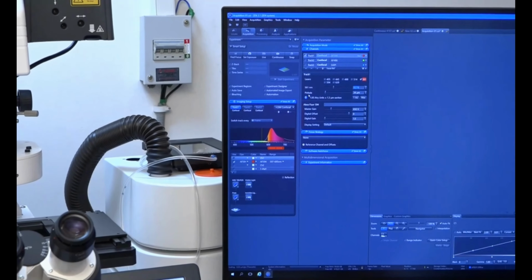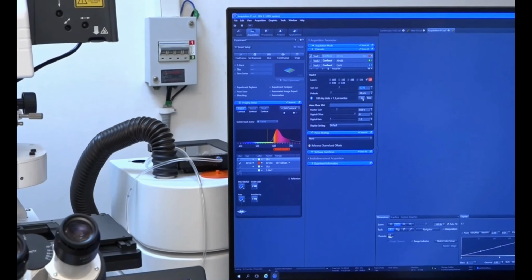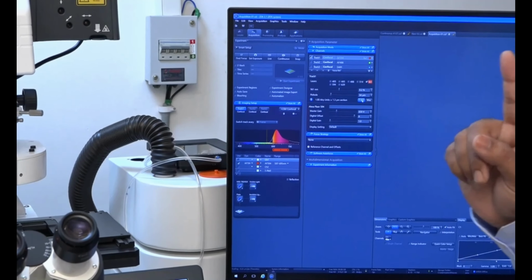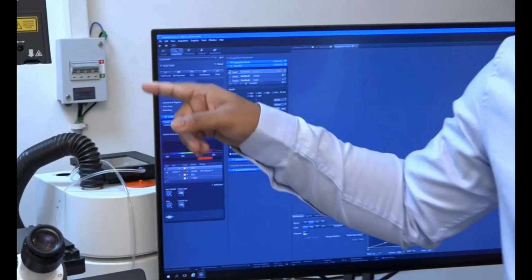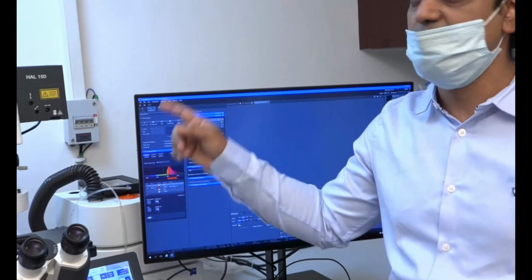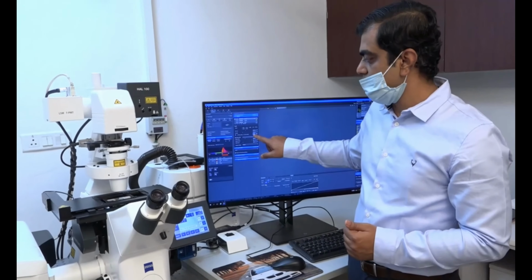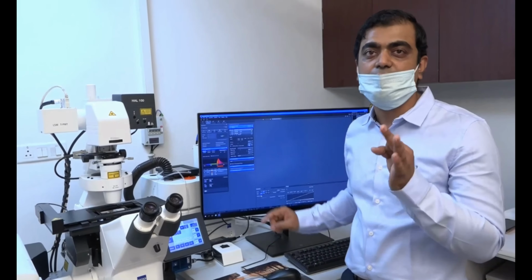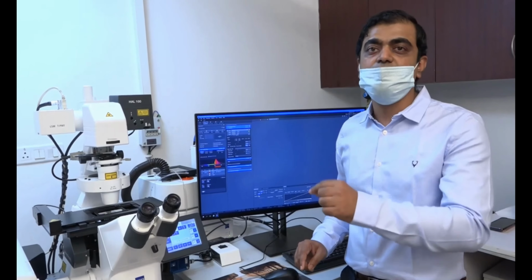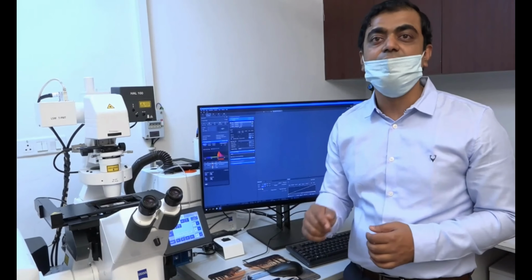Now as this is a confocal system, the instrument has to be optimized based on the pinhole aperture which is internally present at the conjugate focal plane of this microscope. Now at the conjugate focal plane, the pinhole aperture size or the diameter entirely depends on the point spread function, which we say here as 1 Airy unit.